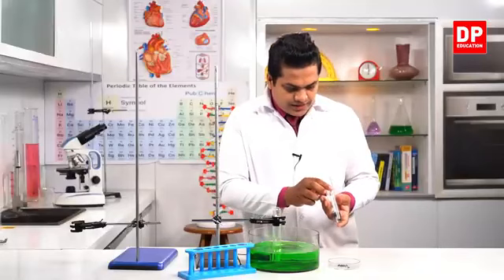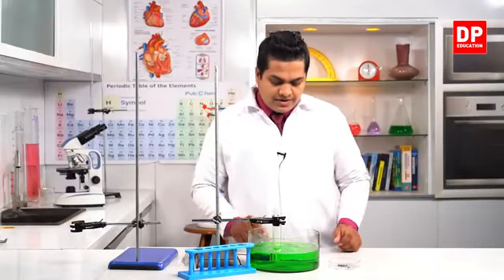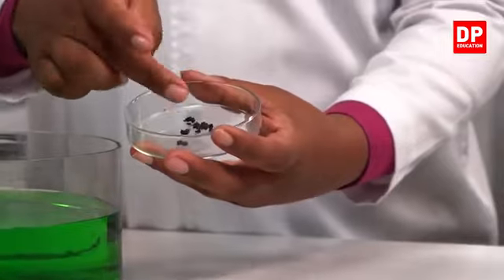I can't take the entire iron powder because, as you remember, I added some water into this cotton wool.